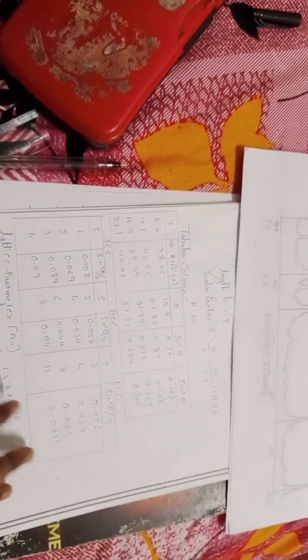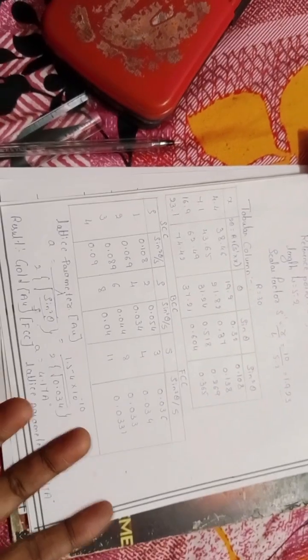This entire calculation shows that this gold crystal belongs to FCC. This is the entire experiment.